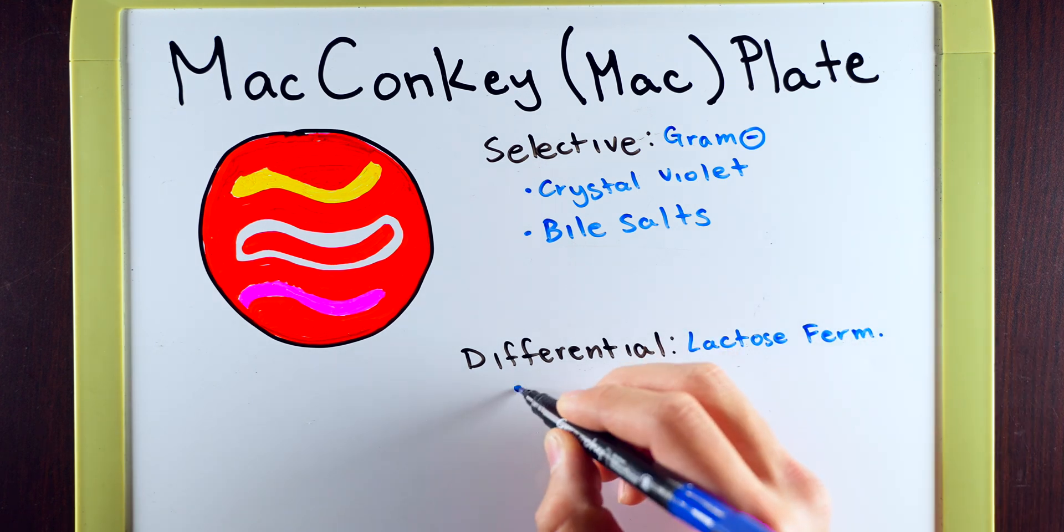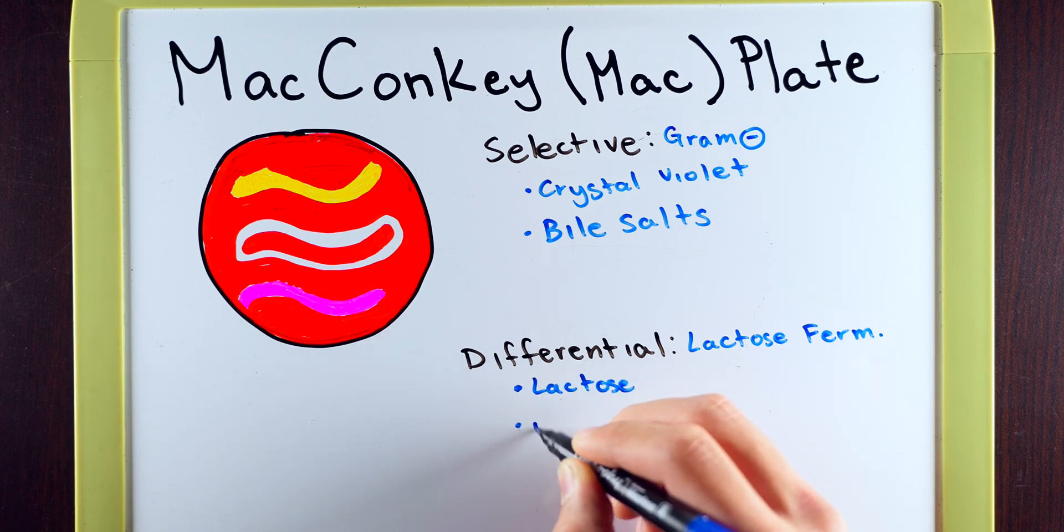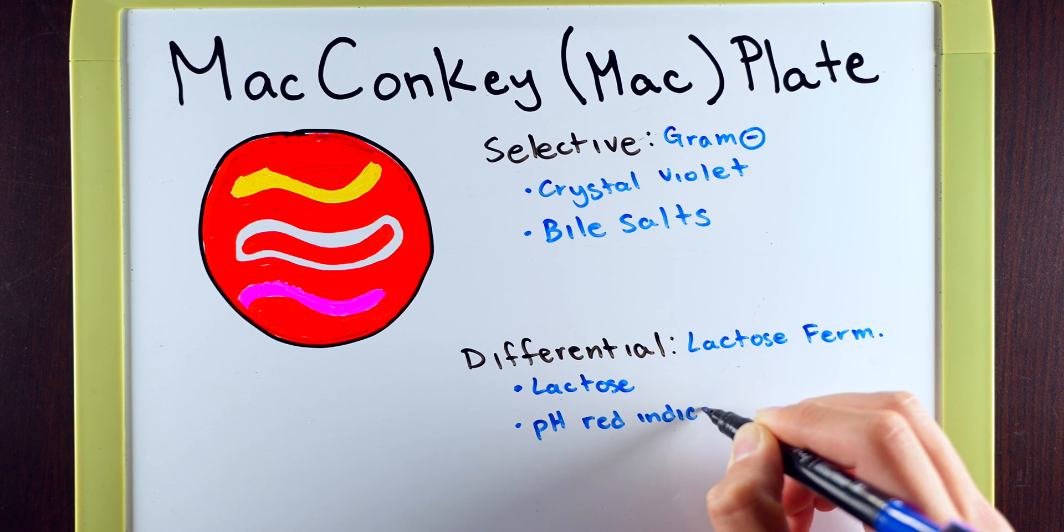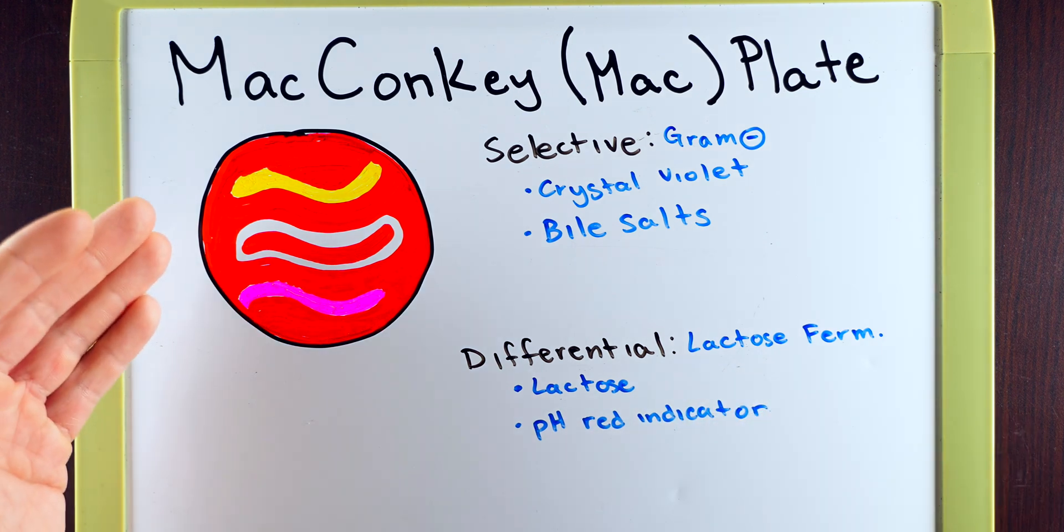And the way that we're going to know this is because we included lactose, which is what the bacteria would take up if it is a lactose fermenter, but also pH red indicator. And this is exactly why we have this red color on the plate.